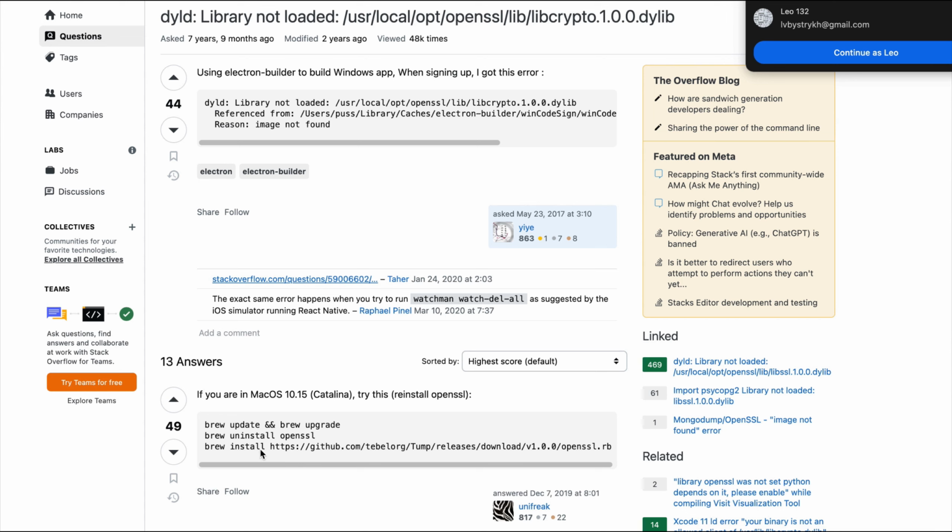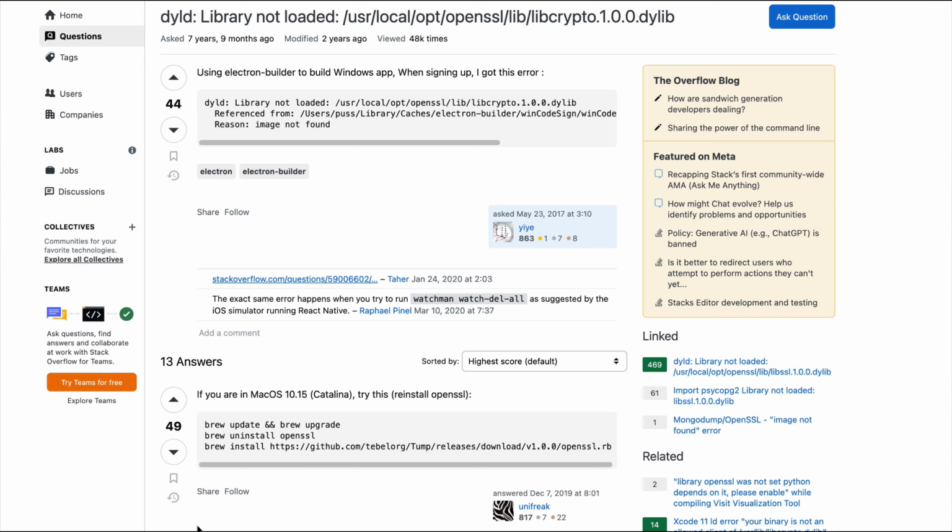It is about OpenSSL, and there seems to be a conflict of versions in my particular case, so I give up here with conda. And by the way, it works well on my other Linux computer, and it should be fine with Windows as well.